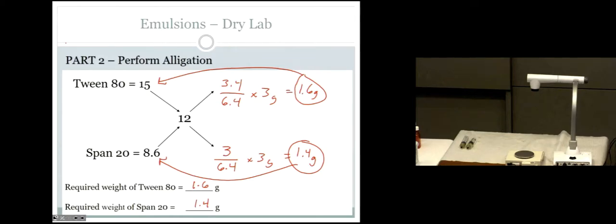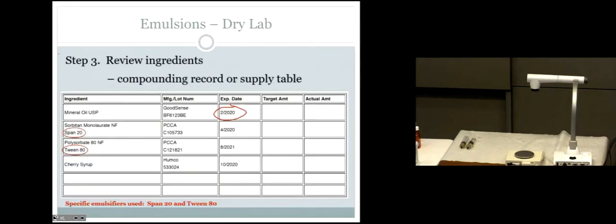Let's fill out the compounding record. The target amount for mineral oil is 30 mls as stated in the prescription. Span 20 is 1.4 grams. Tween 80 is 1.6 grams. For cherry syrup, we need to account for the volume of the emulsifiers — so put 'QS 30 mls' for the cherry syrup, meaning you'll add cherry syrup up to approximately 30 mls to make the total 60 mls.